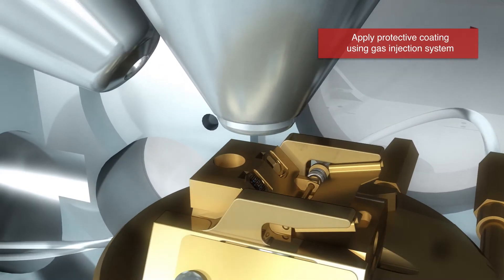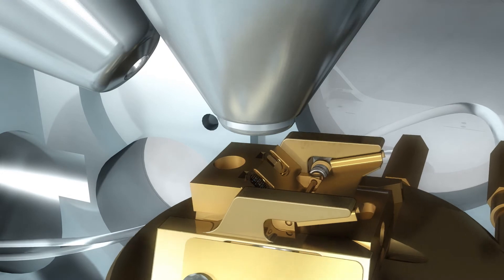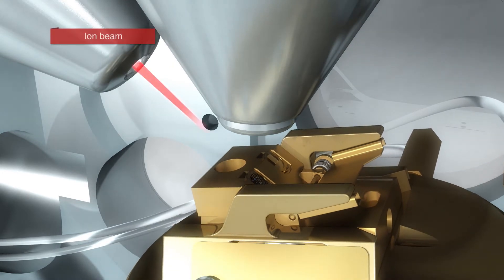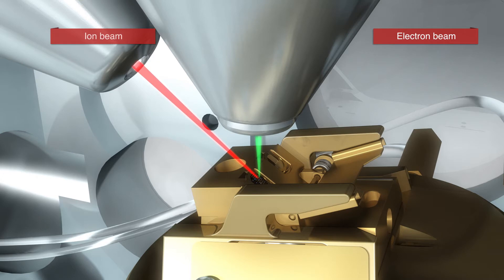Inside the cryo dual beam microscope, the electron beam is used for imaging the sample and the ion beam ensures precise removal of material from vitrified cells.